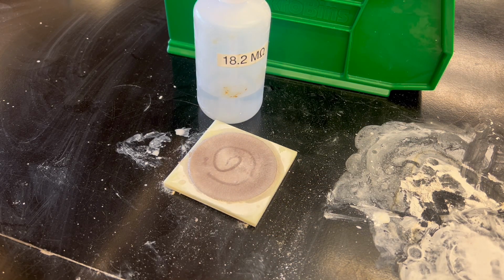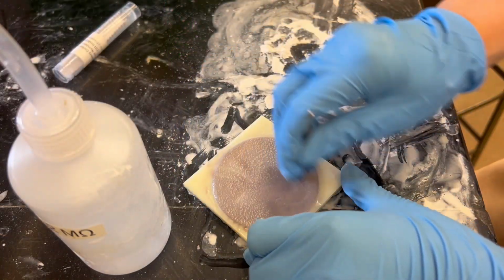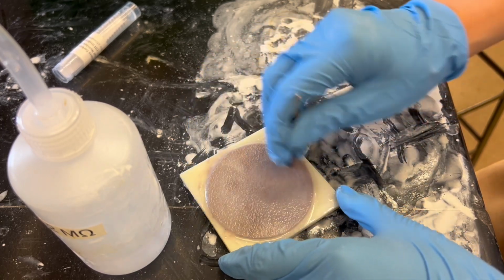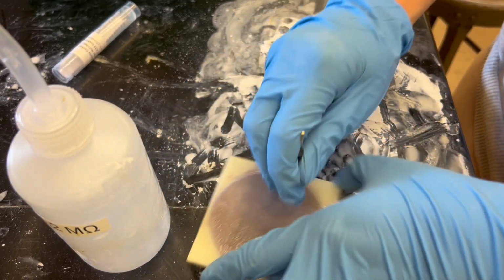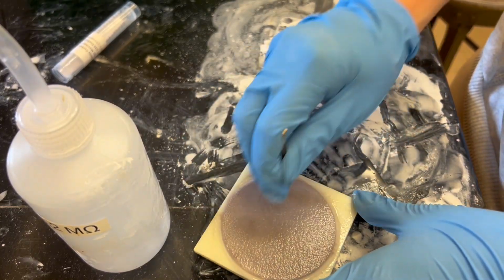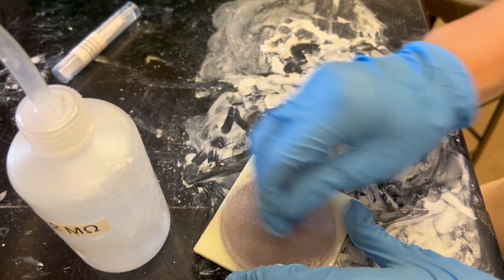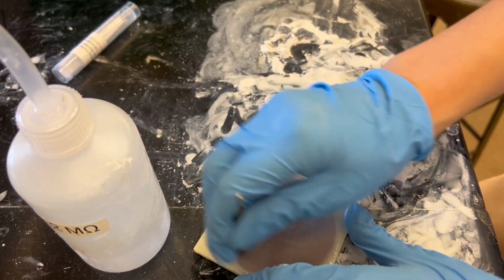Because I need 3 electrodes, but I don't find it very efficient to grind them 3 together, because I cannot make sure they're polished very well if I polish 3 of them together. So I polish 1 at first and then 2 together. While we're grinding 2, we take off the rubber so they can get close while we're grinding. That could help us polish them better.